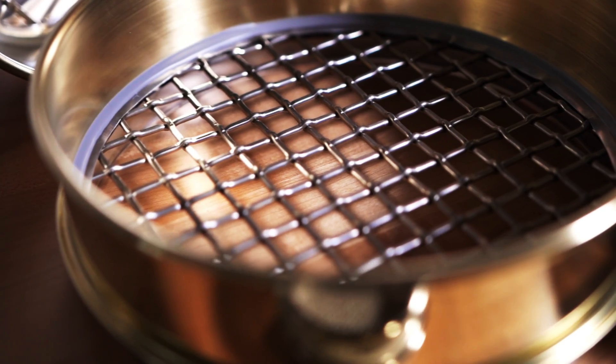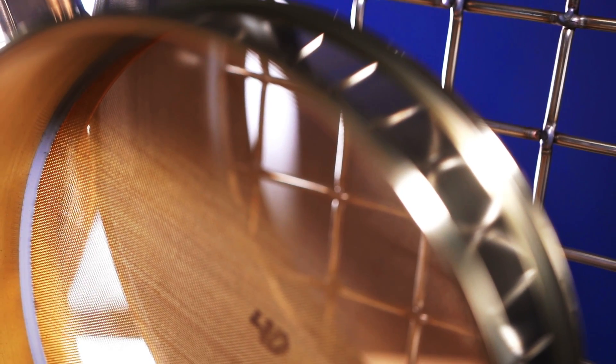Brass by nature is a softer alloy, which means it's prone to denting easily. And as brass is exposed to humidity, the sieve will start to discolor. The discoloration doesn't really affect your results, but it doesn't look the best.